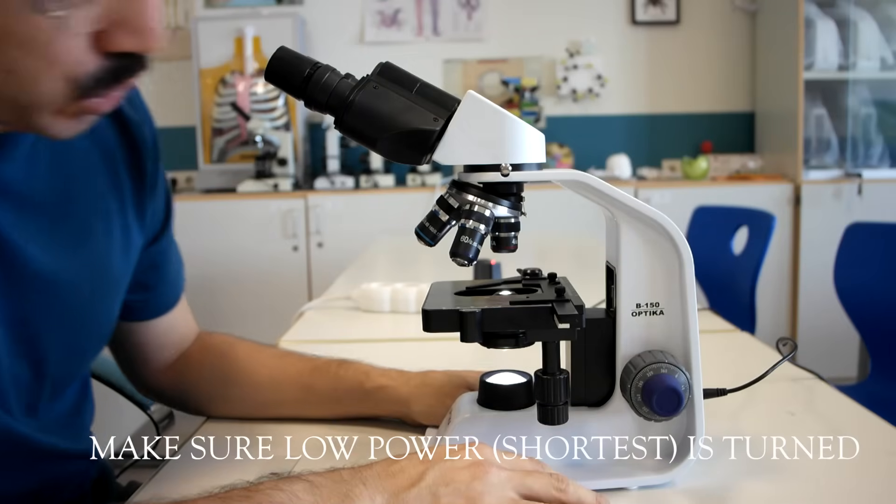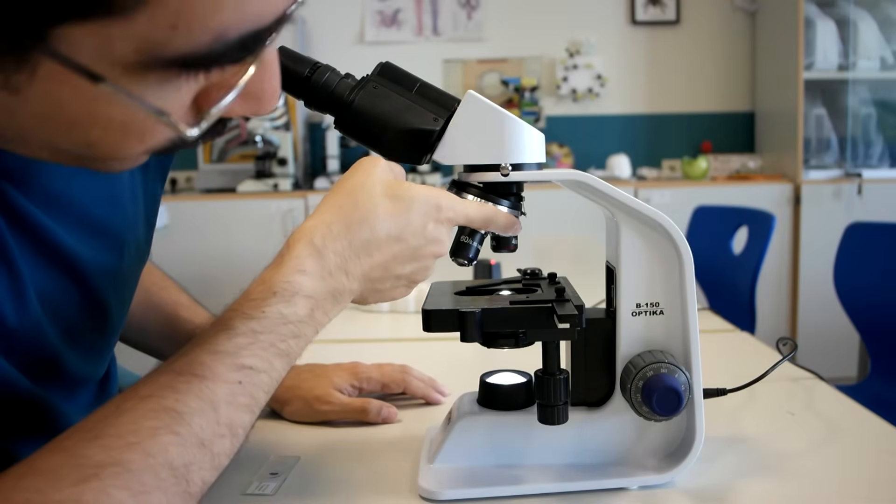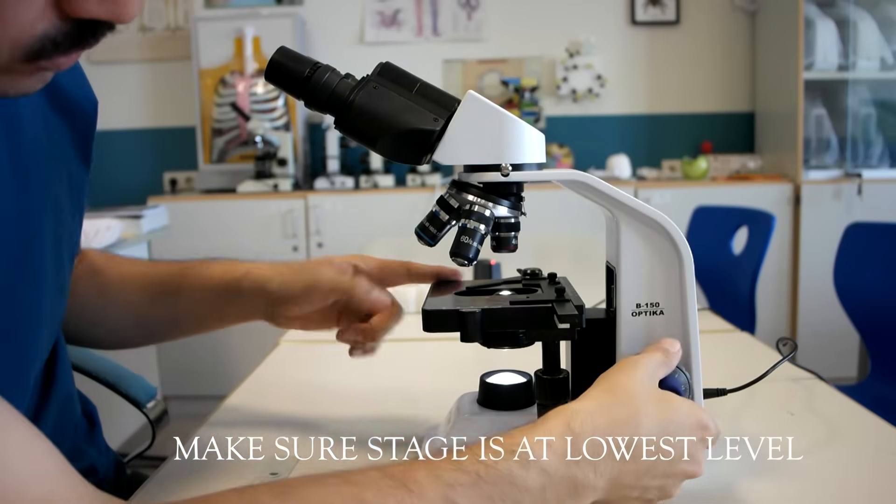First, make sure the shortest one, the low power objective lens, the 4, is turned on. Make sure it's turned on. Then make sure the stage is down.